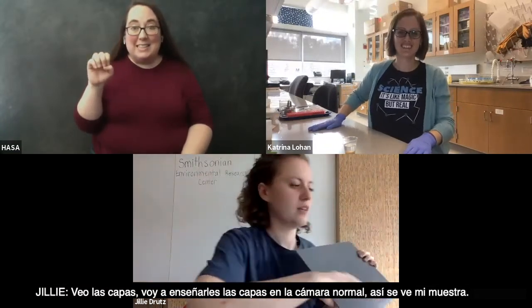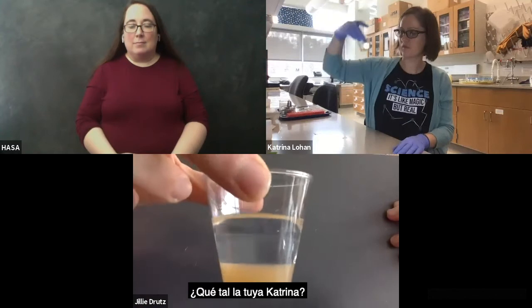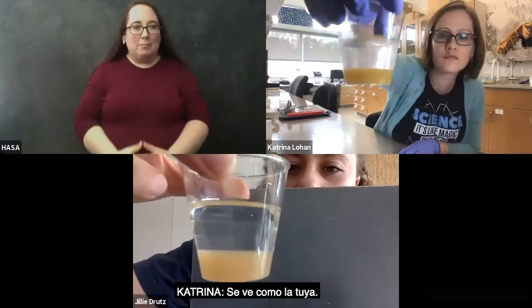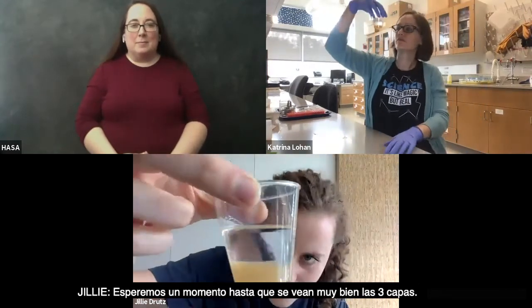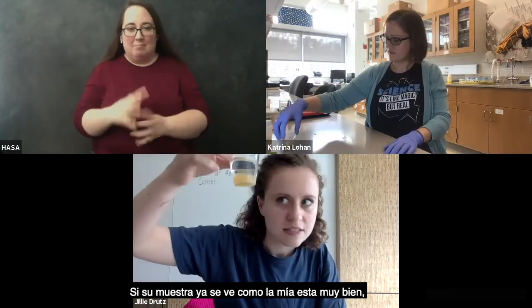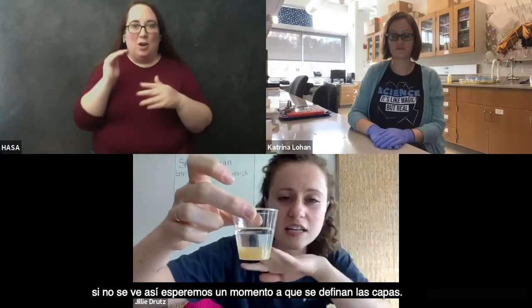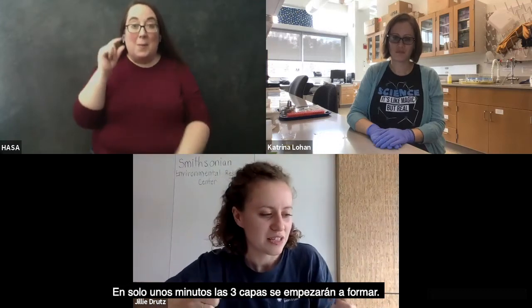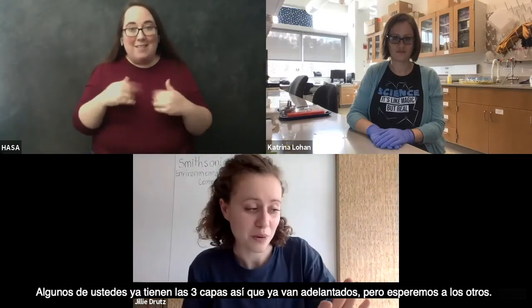All right. So this is what my sample looks like right now. How about you, Katrina? What does yours look like? Looks like yours. It looks really similar. Ooh, okay. So why don't we wait a couple minutes and we can come back? We want to wait until there's 3 very distinct layers. And if your sample looks like this, that's totally fine. If you wait a little bit longer, eventually, just a couple minutes, those 3 layers will start to form. Some of you might already have the 3 layers, which means you are way gentler pourers than us.